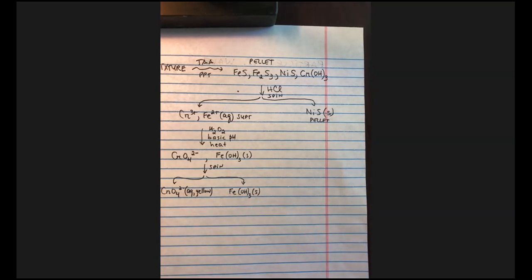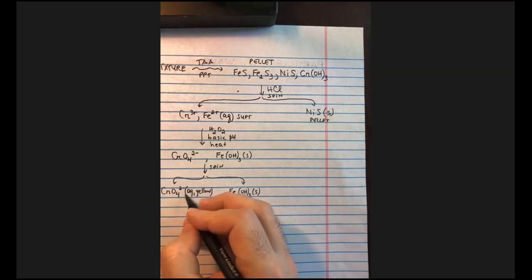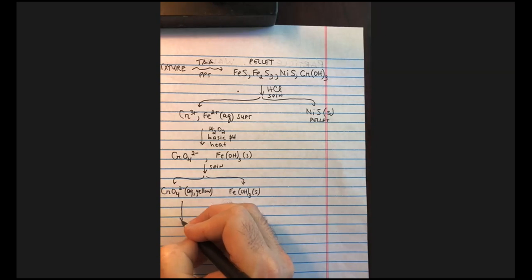All right. And now what we're going to do is we would like to confirm the presence of these guys. So for the chromate, which is the result of oxidizing that chromium ion, we are going to reverse that process.